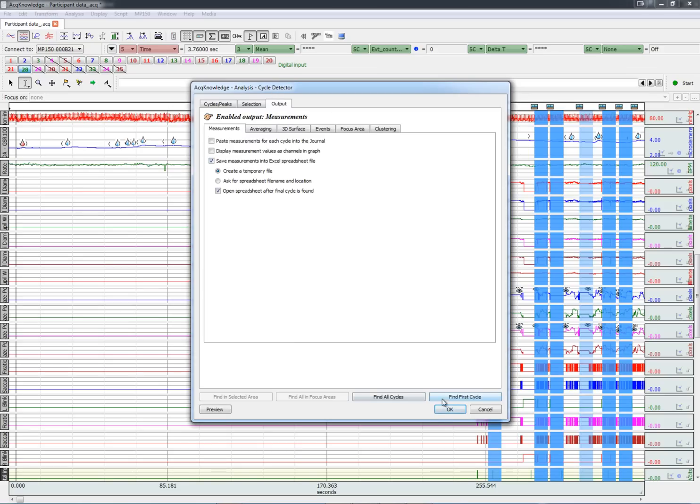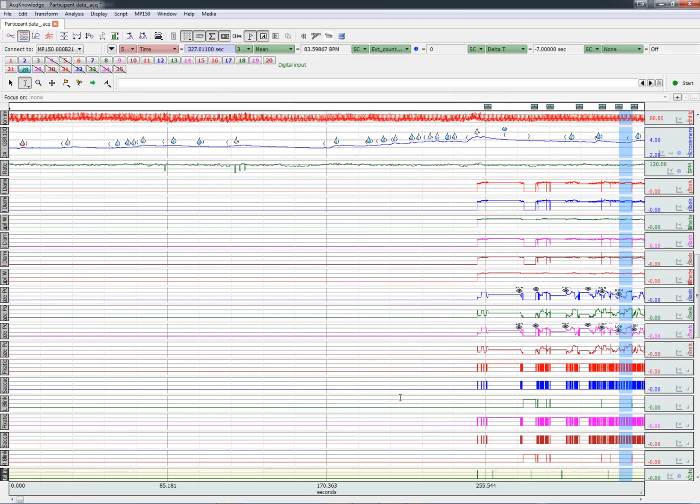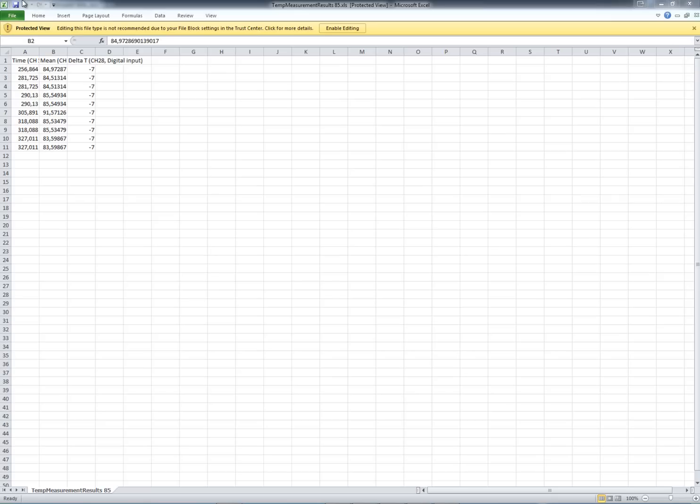Let's go ahead and look at the results. And we can see the time of each stimulus presentation and the mean heart rate for the 7 second period that followed the stimulus presentation.